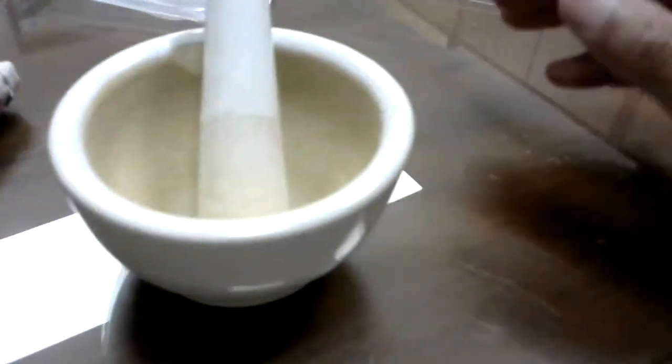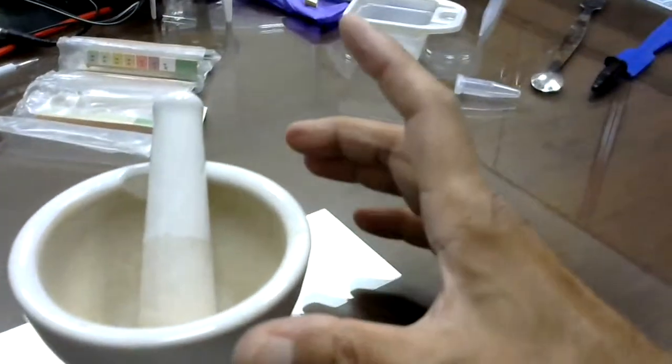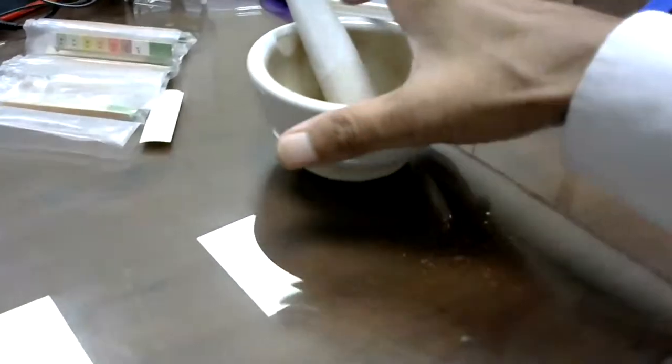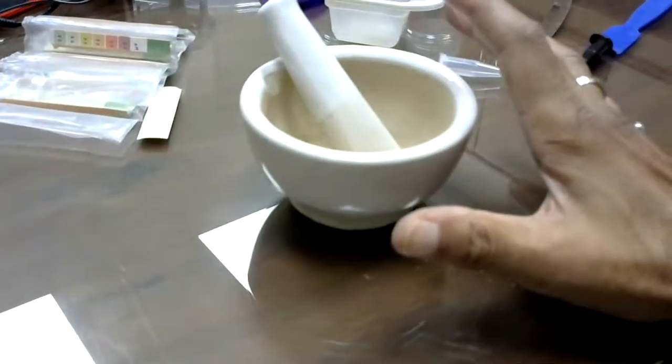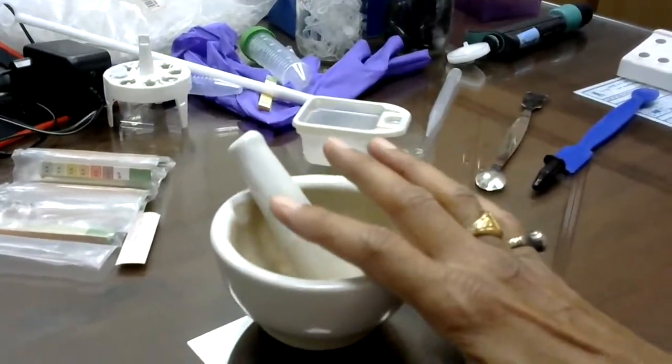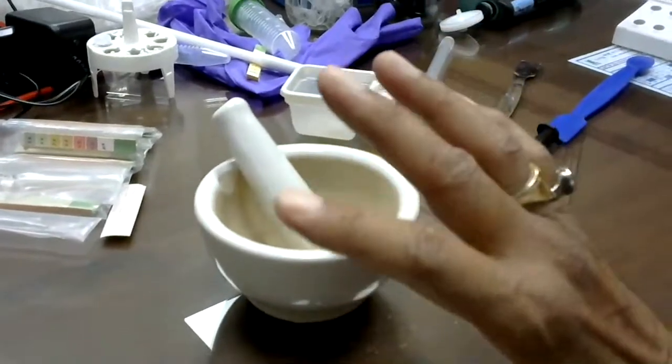This pestle and mortar is made of clay, china bone, that sort of thing. After using it, you have to clean it, and depending on the experimental requirement, you may need to autoclave it so that there is no bacterial contamination.